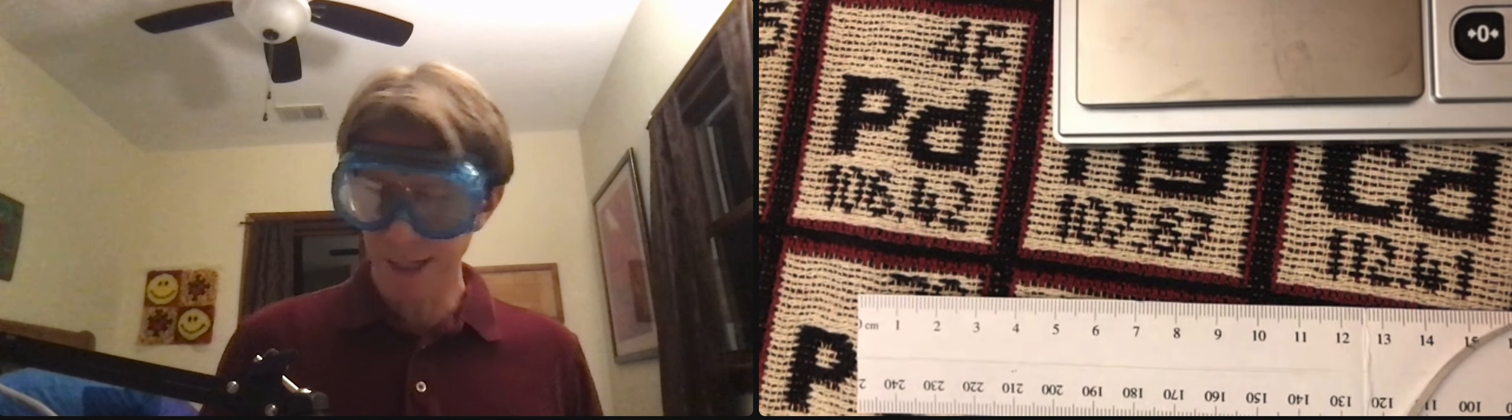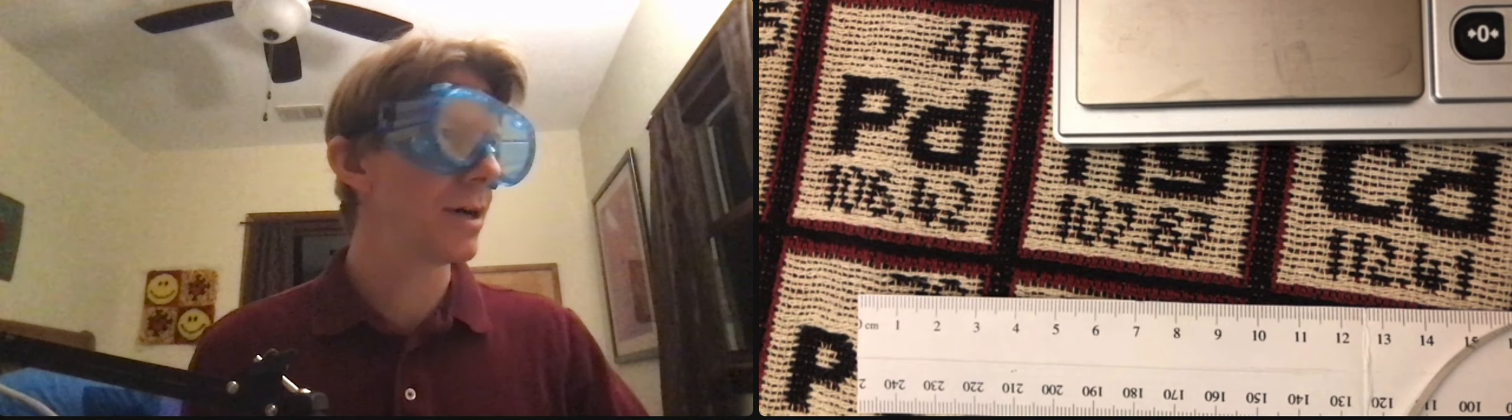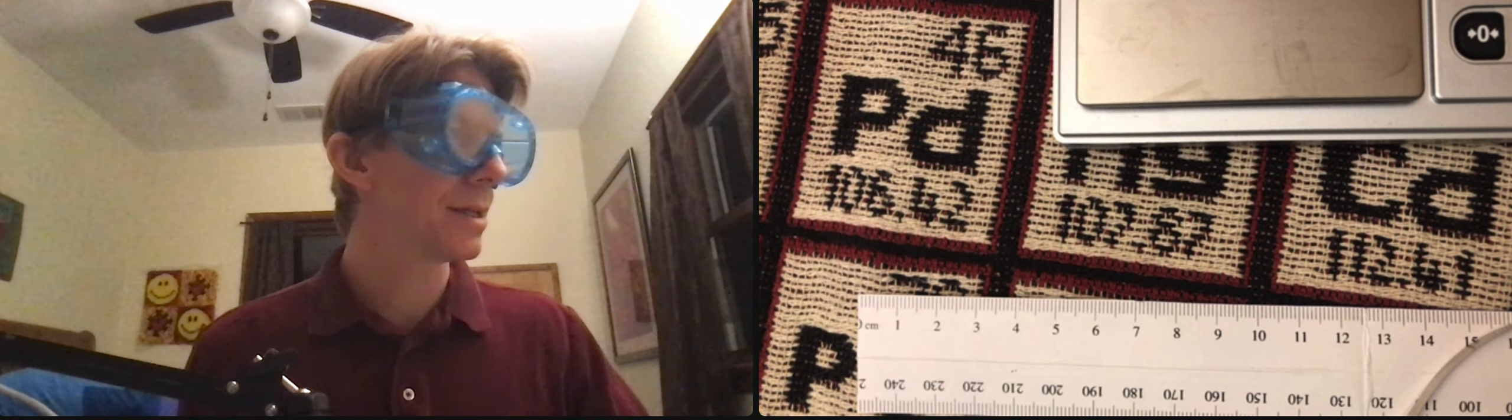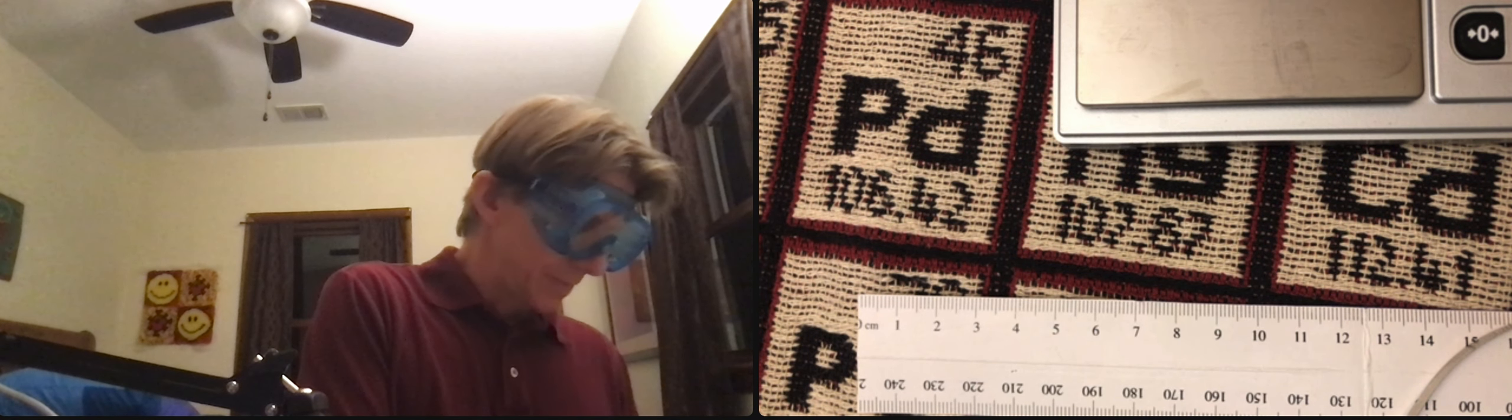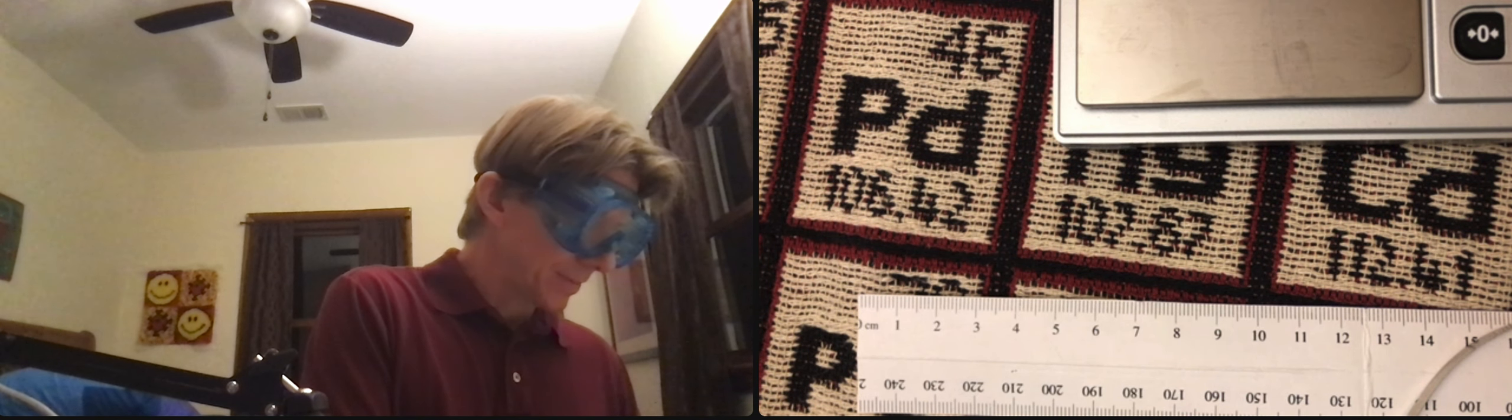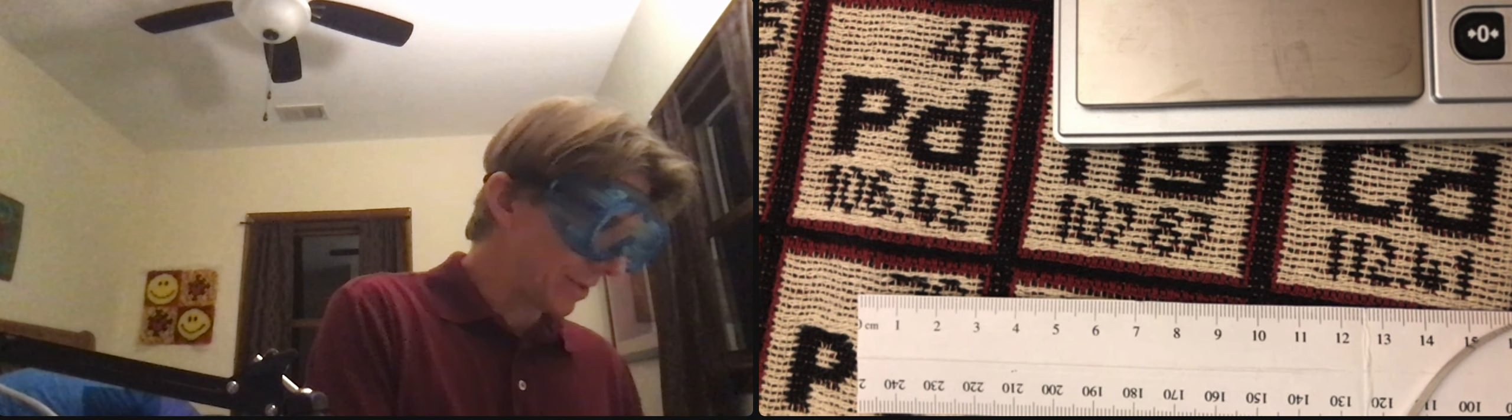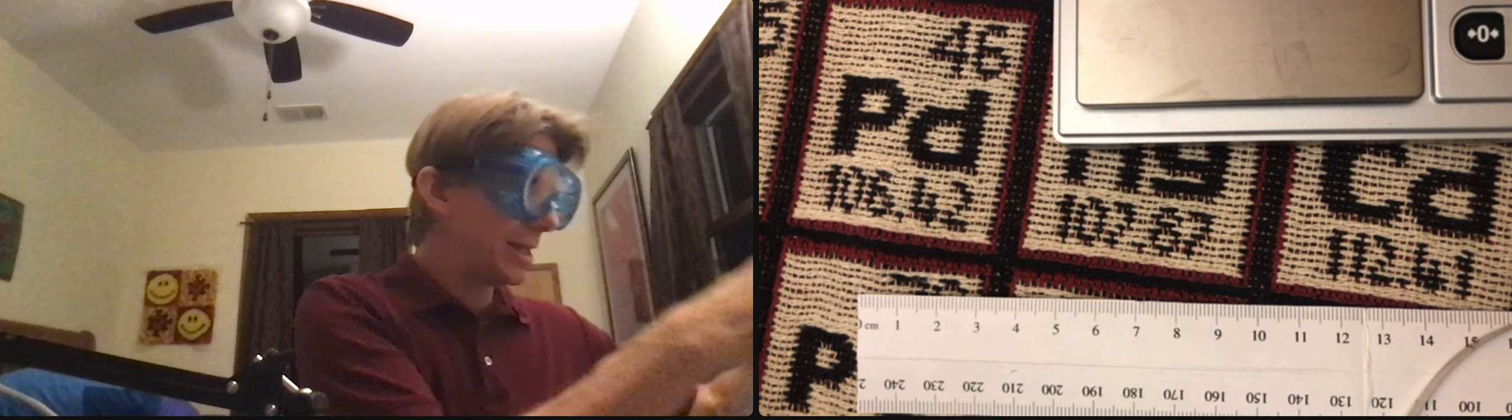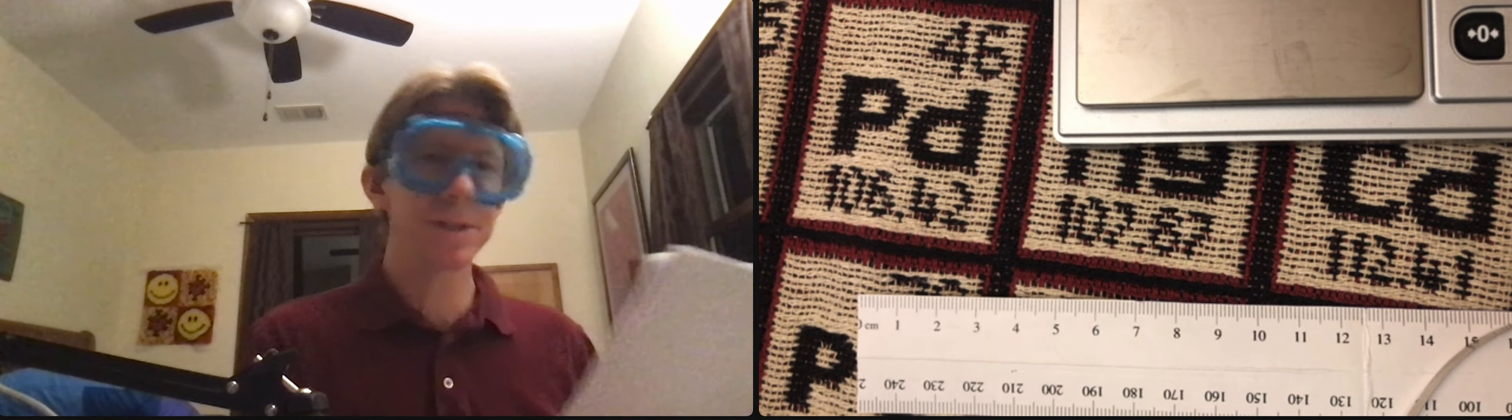All right, now we're going to pick up on page 8, I believe. Yes, page 8, part 2, experiencing double and single replacement reactions.